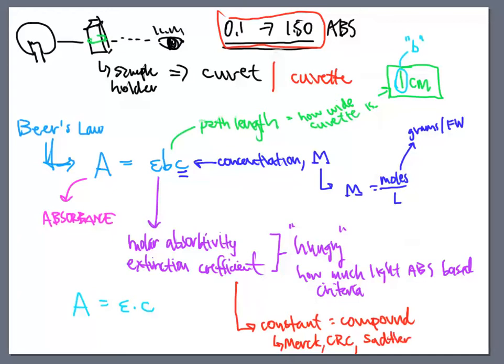Again, those are the 3 reference books that we have in our laboratory that we use to get this information from. This also had our lambda maxes that we needed for each compound, right? Those lambda maxes were listed, and molar absorptivities are listed as well.